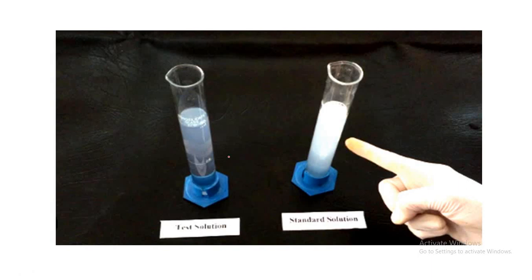So here you can see that you have prepared the test solution. This is the test and this is the standard solution. So you can see here the turbidity is more in the standard solution, or you can say the turbidity or the opalescence is lesser in the test solution than the standard solution. Then this test will pass.